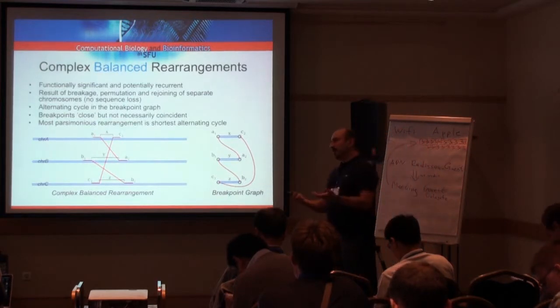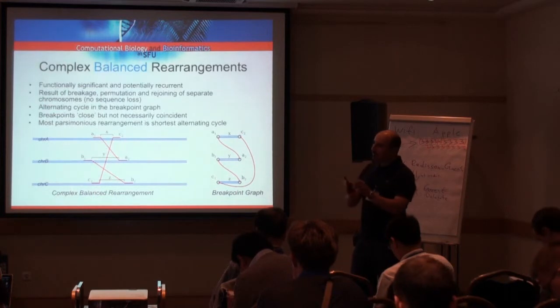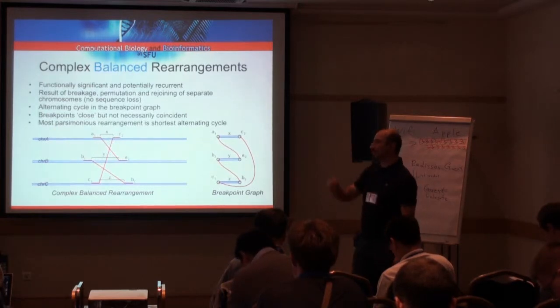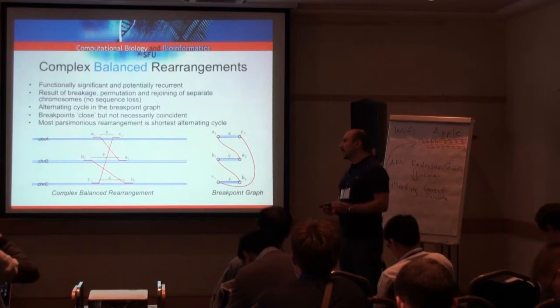We also use arithmetic coding. It turns out that by simply discretizing the quality scores in any way you want, simple quantification and discretization, right, 1 to 5? More like 1 to 10, you don't lose mapping accuracy.